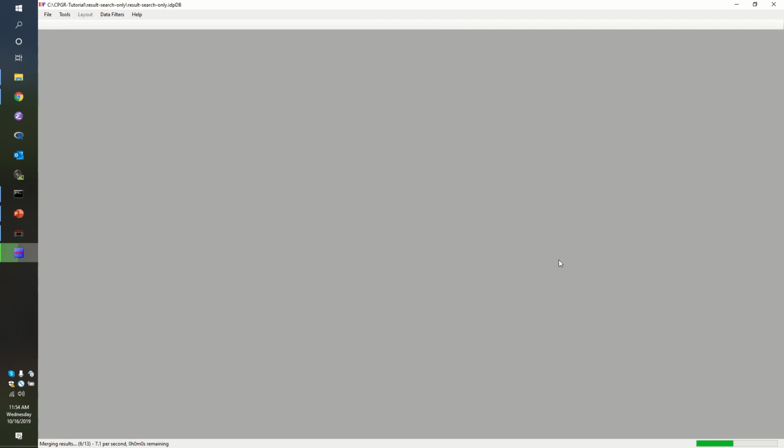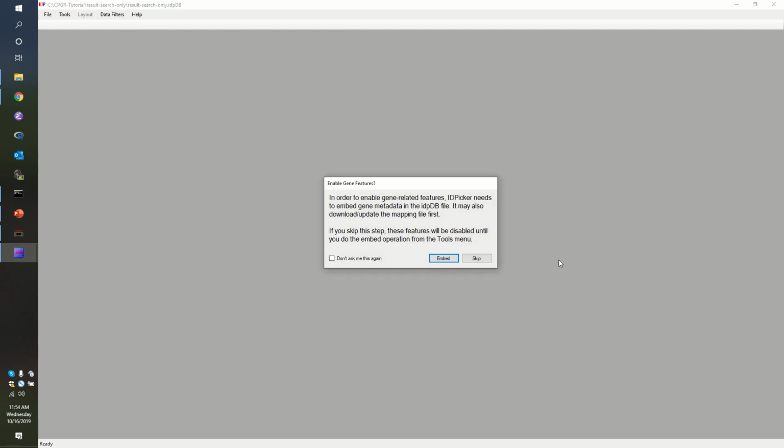Yes, there's a question. So the decoy prefix was rev underscore, was that? REV underscore, yes. Just to make sure. Yep. Max rank and max FDR, sorry, I was navigating to this point. Okay, so max rank is 1, FDR I used was 0.05, yes.